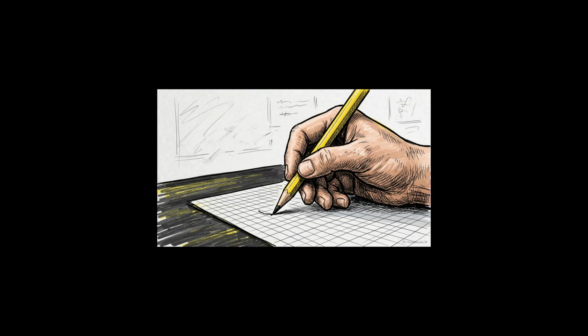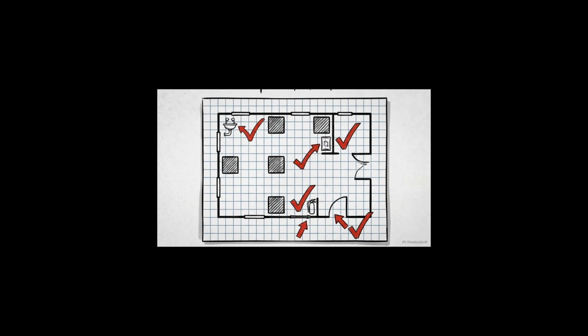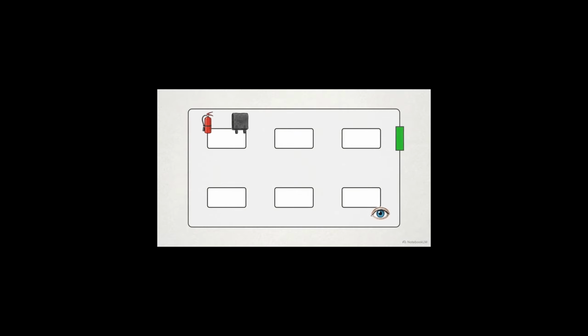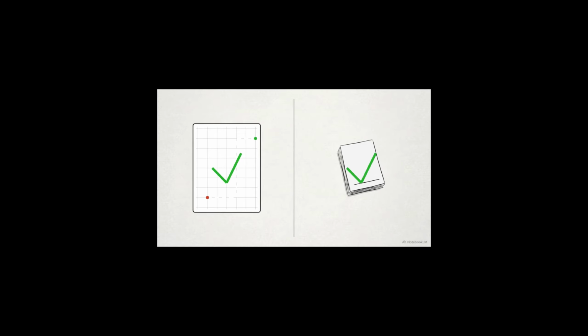Next, you transition to spatial awareness. Have the students create a safety map of the room. They will draw a floor plan on grid paper, checking off the locations of the eye wash station, fire blanket, extinguisher, and exits. By physically walking through the room to map these tools, students build muscle memory. If a crisis happens, they know exactly where to go, preventing panic and disorientation. Combining these spatial mapping exercises with signed safety contracts ensures everyone knows the protocol. This cuts down emergency response times and actively secures your baseline duty of care.